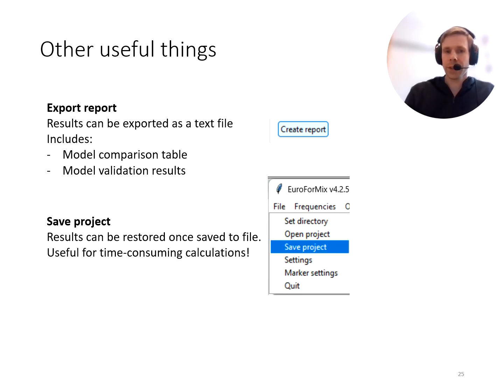Also, when you have done calculations, you can store the results or your session as a project as a separate file. This is useful if you have very time-consuming calculations. Then you can save after the completion, and you can easily load the results again another time.